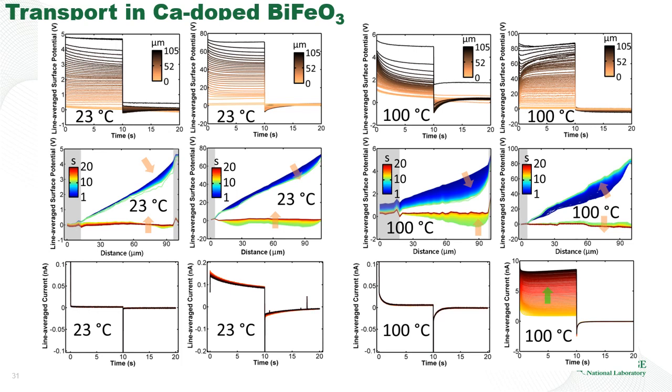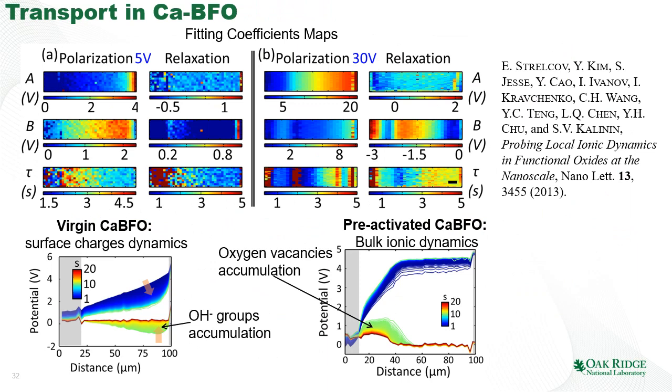What's rather interesting is that depending on conditions, we can see the evolution towards the polarization. Ions can move, but they cannot leave the material, leading to the onset of ionic conductance. The material starts to be electroformed, and currents start to increase as a function of time. In fact, we can even create the electroformed region next to the electrode, and the material now behaves as a junction between the conductive region and the non-conductive region. So it's really rather exciting.